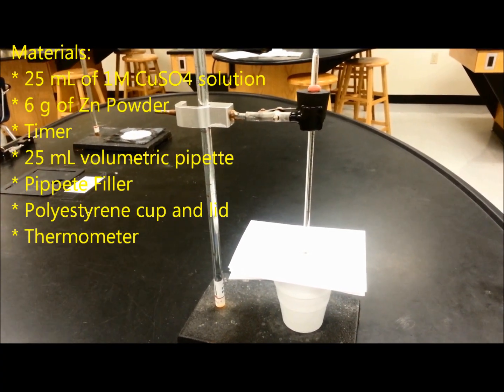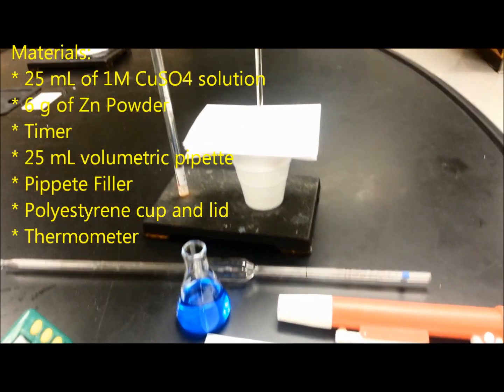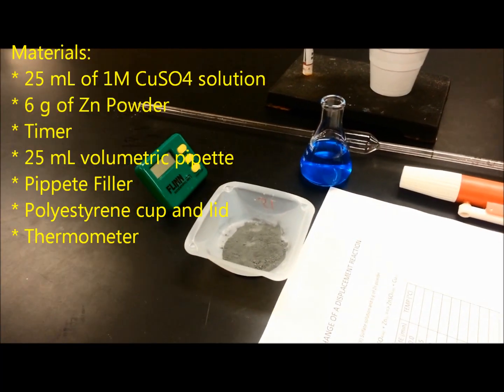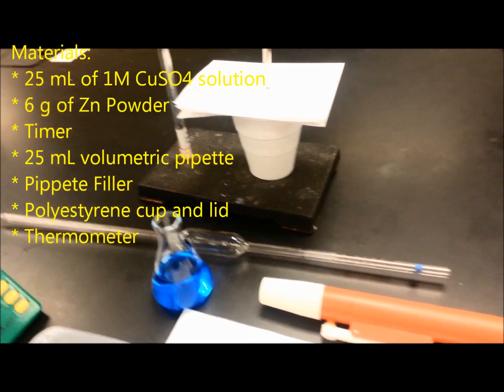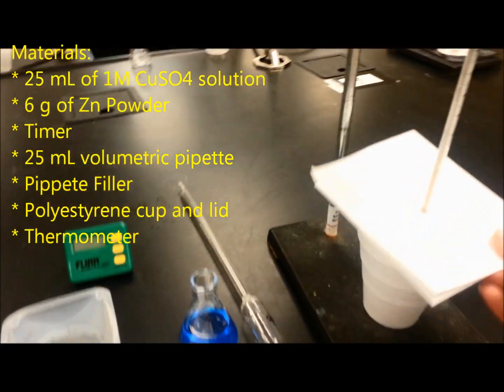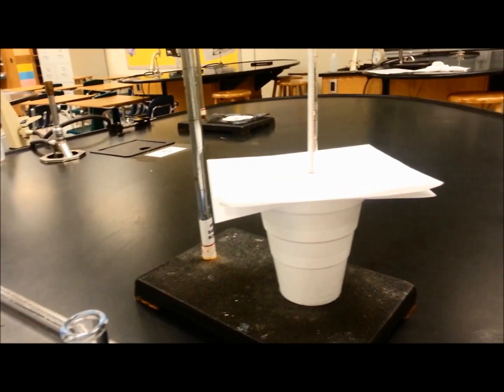Enthalpy change of a displacement reaction. For this lab, we're going to need 25 milliliters of copper sulfate solution and zinc powder, a timer, a pipette, a pipette filler, a styrofoam cup, a lid of any kind, and a thermometer that we attach so we can move the styrofoam cup while the reaction takes place.